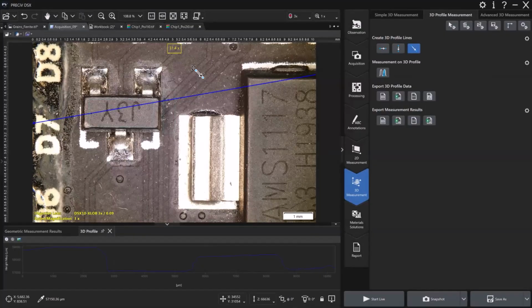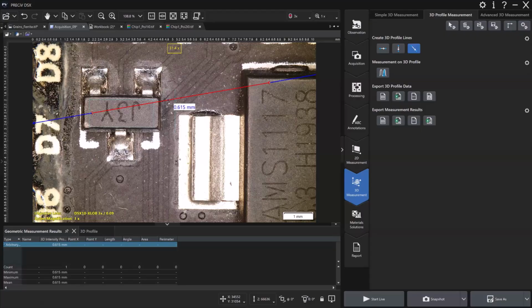There's a lot of built-in tools like that for 3D rendering. And once we have that, we can come down and you can take measurements of any of these points that you want. Maybe I want to go there to there. That point all the way over to that point, measuring a height difference. And the 3D profiles can be exported out as graphs. You can also export the raw height measurement data that you get here to text or Excel documents. Hopefully that answered that question well enough.